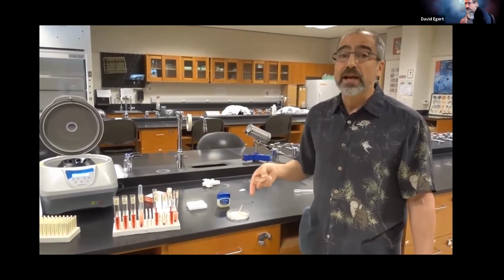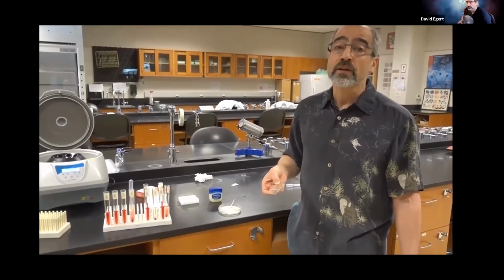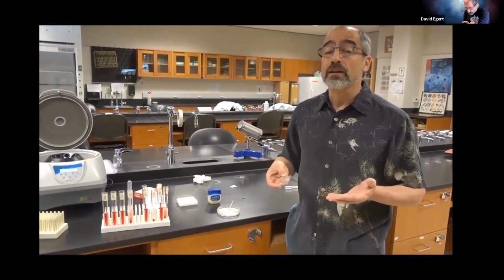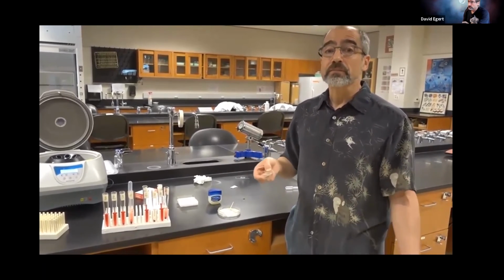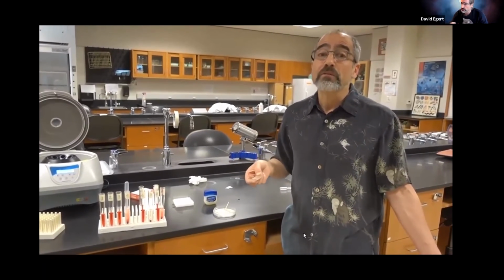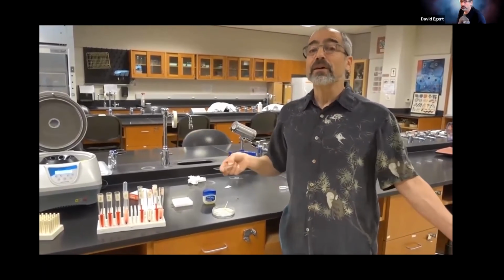This is what you would do for the variety we talked about in the lab manual. Look at test tube 1, look at test tube 3, look at test tube 4, look at test tube 5. You do the same process for each of those, and compare and draw. For our online version, we'll show you pictures. But this is the only way you really know what really happened to the blood cells, particularly if they didn't lyse. So the what now of the blood.